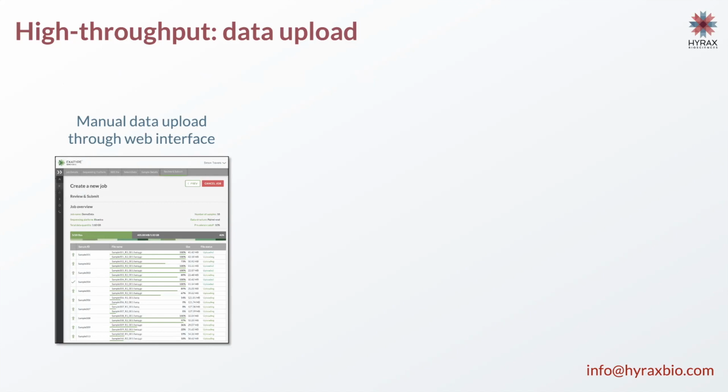So rather than needing to take your FASTQ data, manually process it, upload it to Nextclade, upload it to GISAID, Pangolin, we essentially have taken that entire process, as you've seen, and enabled it to be a single click process that I hope you agree is easy to use.